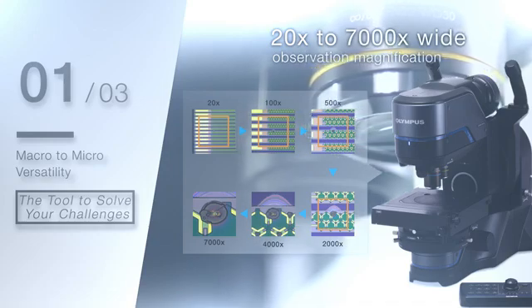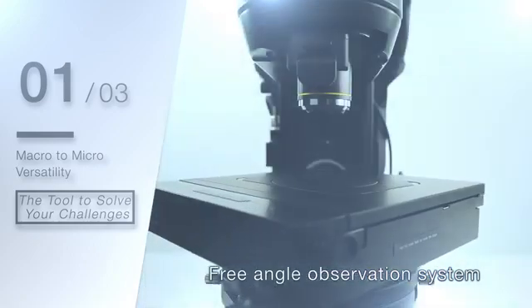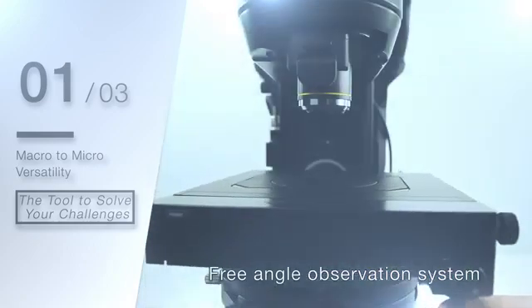A range of lenses is available, including for high resolution and long working distance, while the rotating observation head and stage let you view your sample from almost any angle.